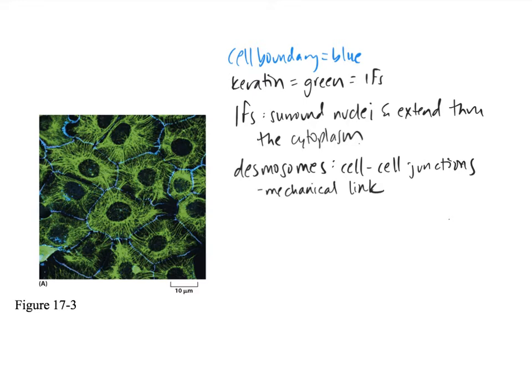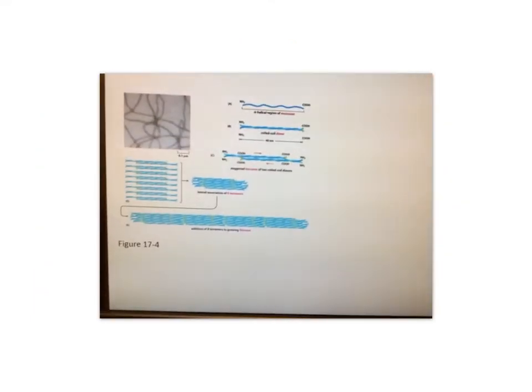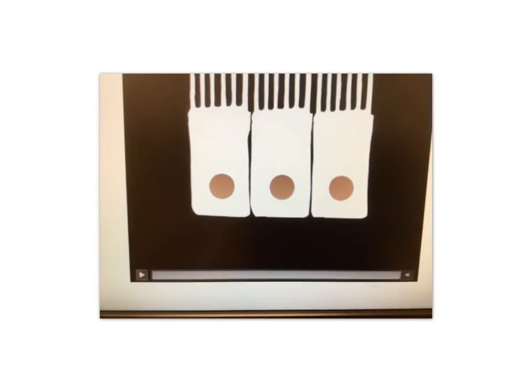So here's a couple of the locations for the desmosomes. Right along here, you can see the intermediate filaments basically extending between the cells, kind of creepy looking. Lots of other locations here. And basically, if you look at pretty much every single one of these cells, you'll see that they have several desmosomes. Oh, that's not what we were looking for.